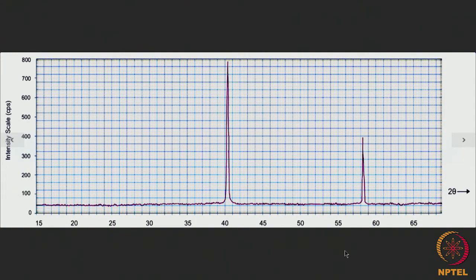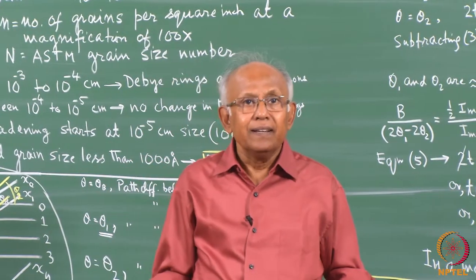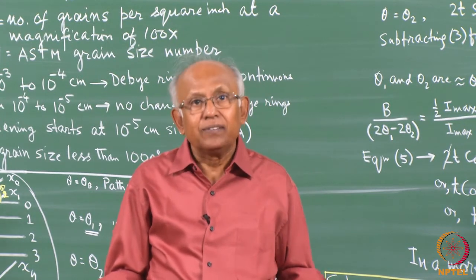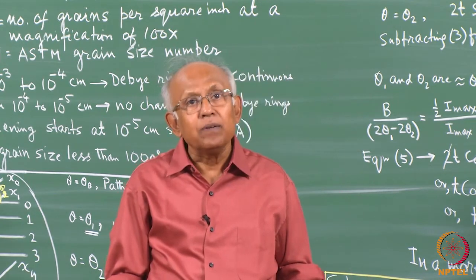Now, if we use a diffractometer, the output will give the lines in this shape, and from there you can find out the line breadths straight away and use them in that equation. Now, when we talk about the breadth of a line, how do we measure it? Actually, there are several ways it can be done, but we mostly use the method given by Warren.